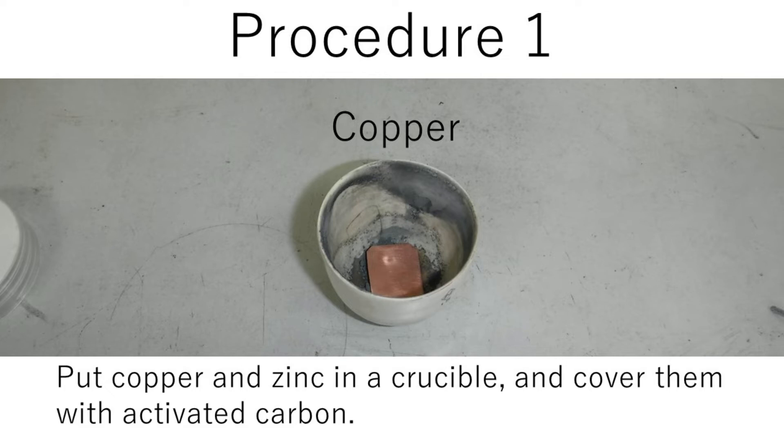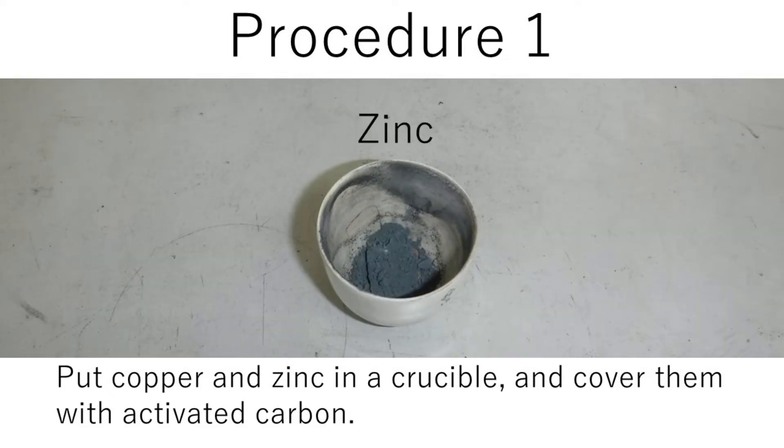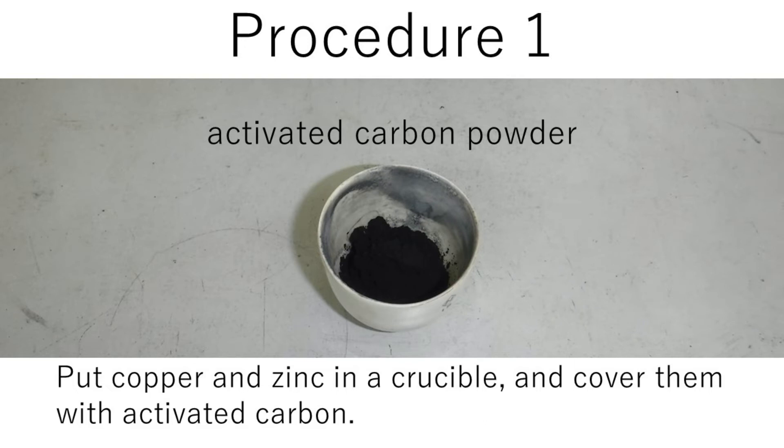Procedure one: put copper and zinc into a crucible and cover them with activated carbon powder.